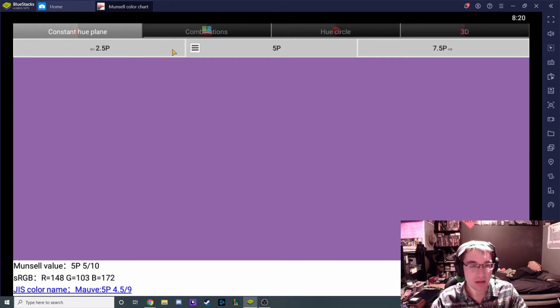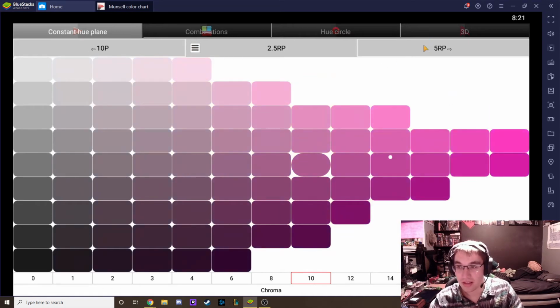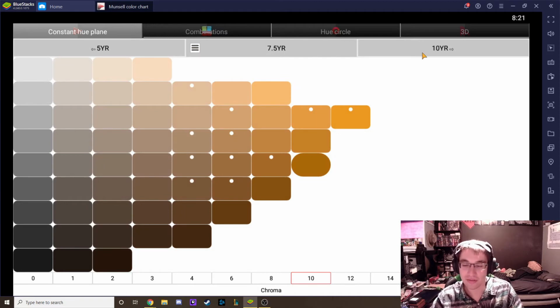So now that you can kind of find what a color is described as, the harder part, and what everybody here has to do, is you have to take your color that you have, your soil, and you have to match it as well as you can to a color chart. And that's what I'm going to do next for you.